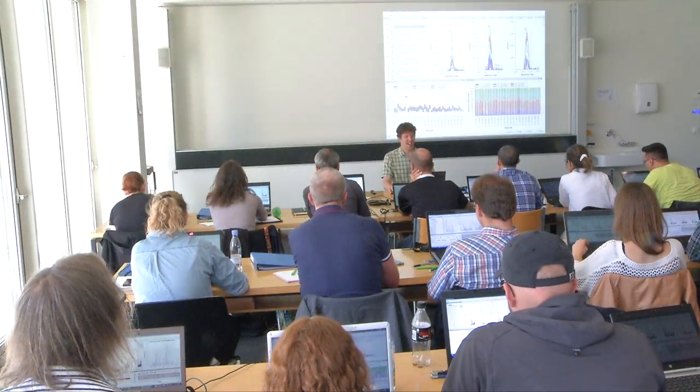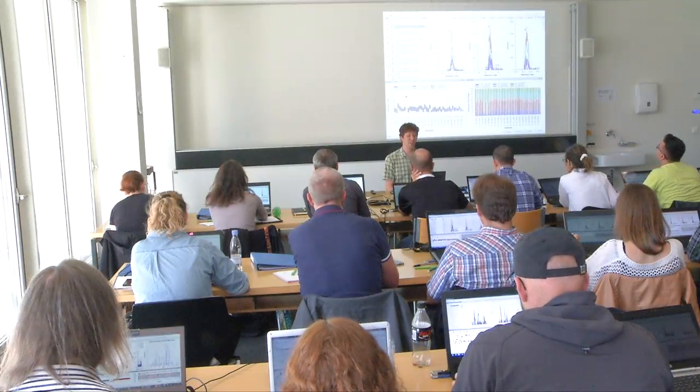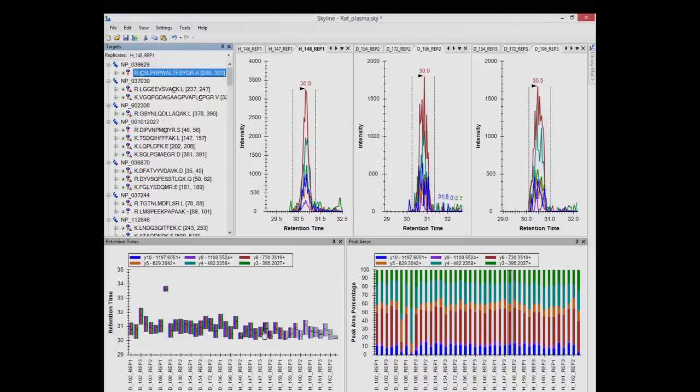All right, next peptide. Does anybody see anything I should look at? Yeah, there's no library match in this case. So what would you look at? Would you go through every chromatogram? Yeah, the one that has different retention time. This one, boy, it's 3 minutes away from everything else. It's probably not the right peak.